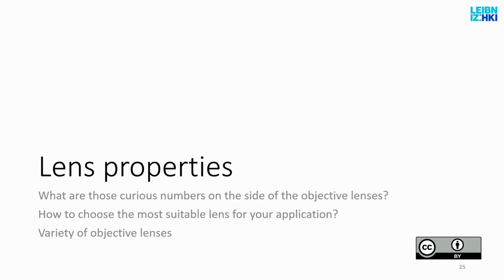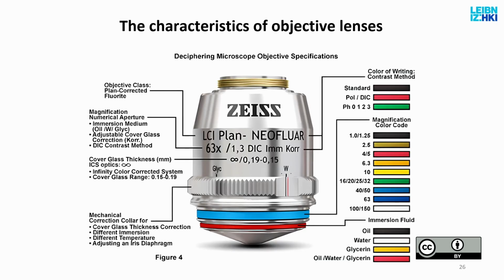Now we talked about how some lenses, or most expensive lenses, are compensated for many of these aberrations, but they also contain more information when you look at a lens closely. It has a lot of mysterious symbols. We will talk about all of them during the morning session.